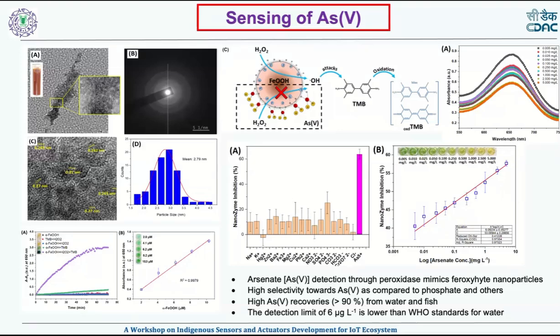If we analyze this non-toxic arsenic in ICP-MS, it will show that arsenic is present, but it will not show that it is the non-toxic form. But if we use this colorimetric method, it will say precisely that the inorganic form of arsenic, which is toxic, is present in the samples. And if we have to test how much arsenic 3 is present, then we can simply oxidize the arsenic 3 using a suitable oxidant, and it will give the total arsenic.